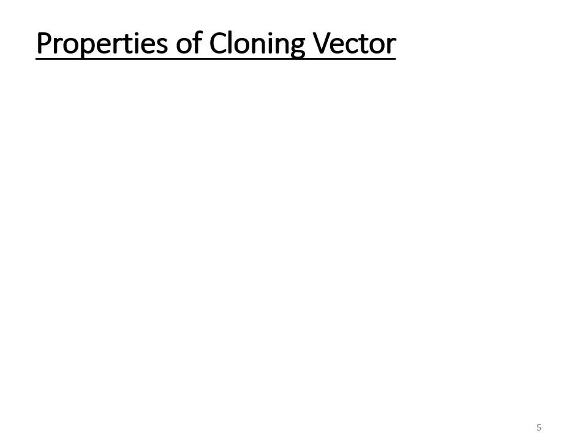For your transformation to go well, and to get the new DNA into those bacteria and efficiently, effectively reproduce it, you want to pick a cloning vector, a lot of times called a plasmid, that has 4 main qualities.